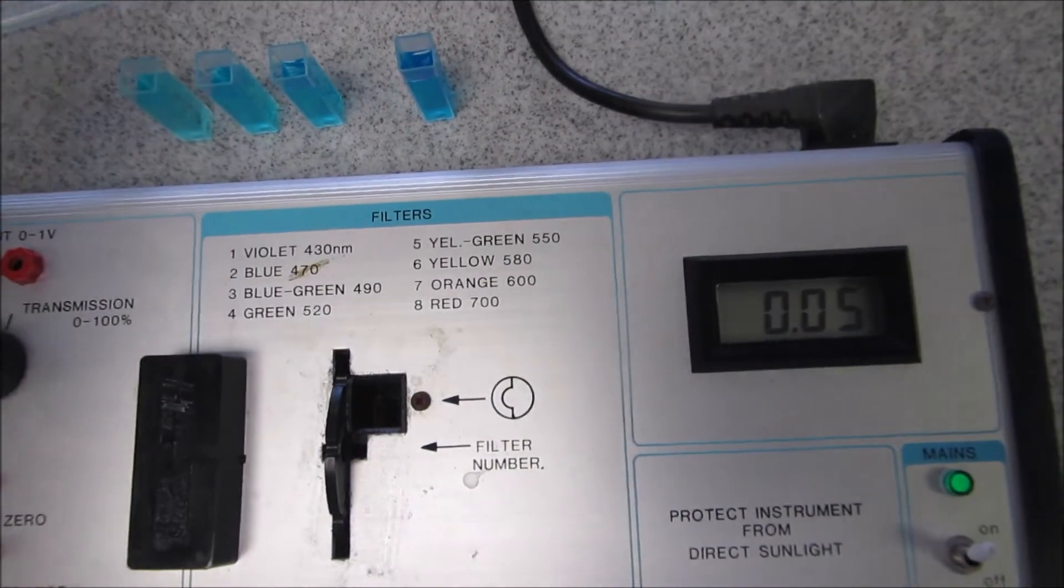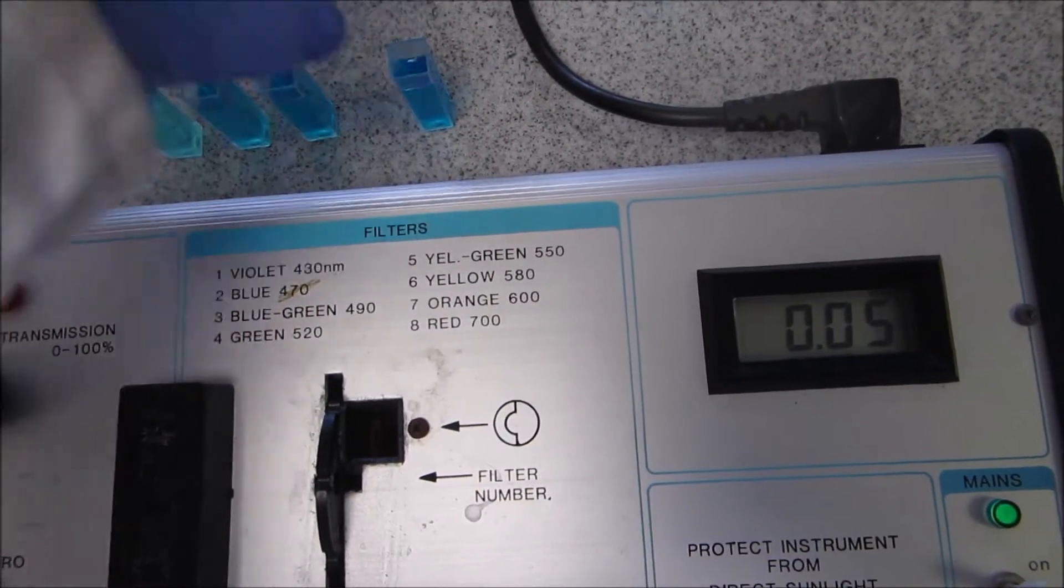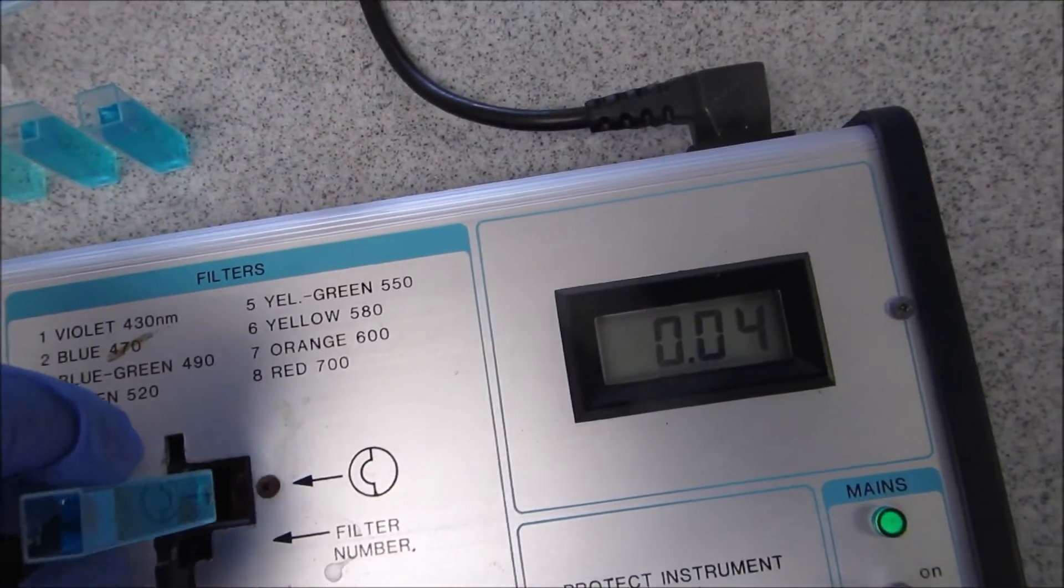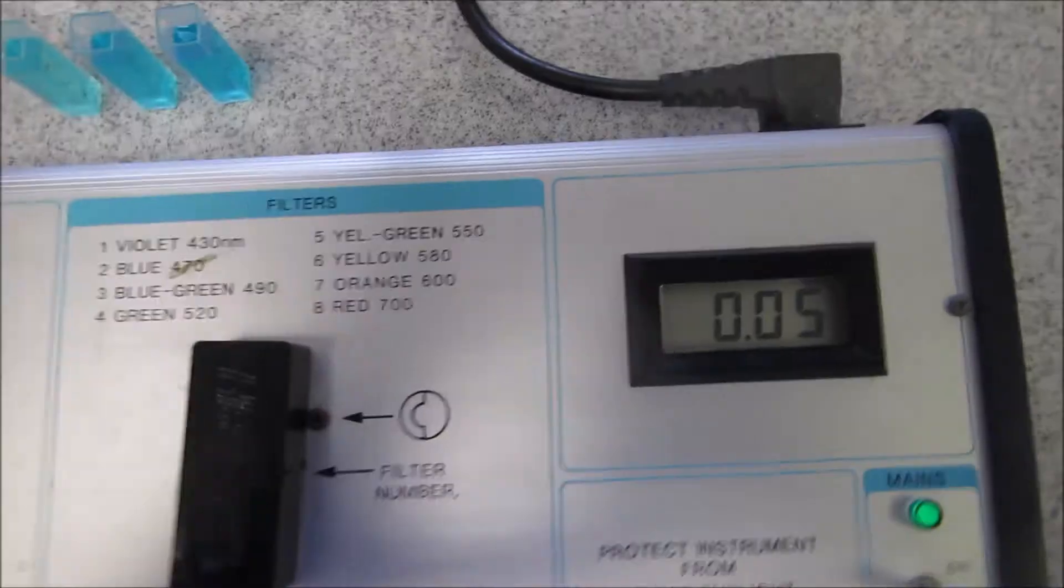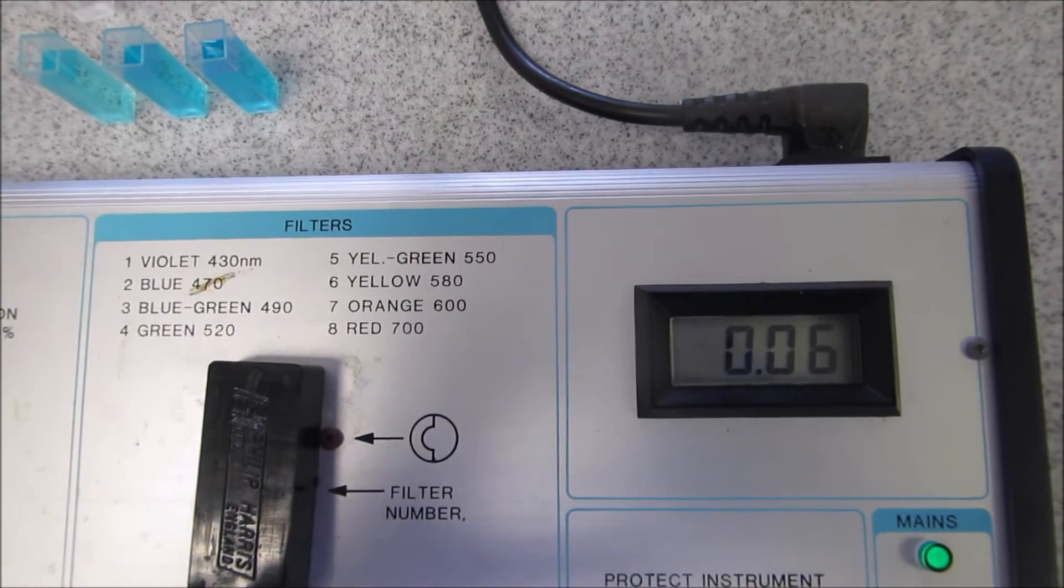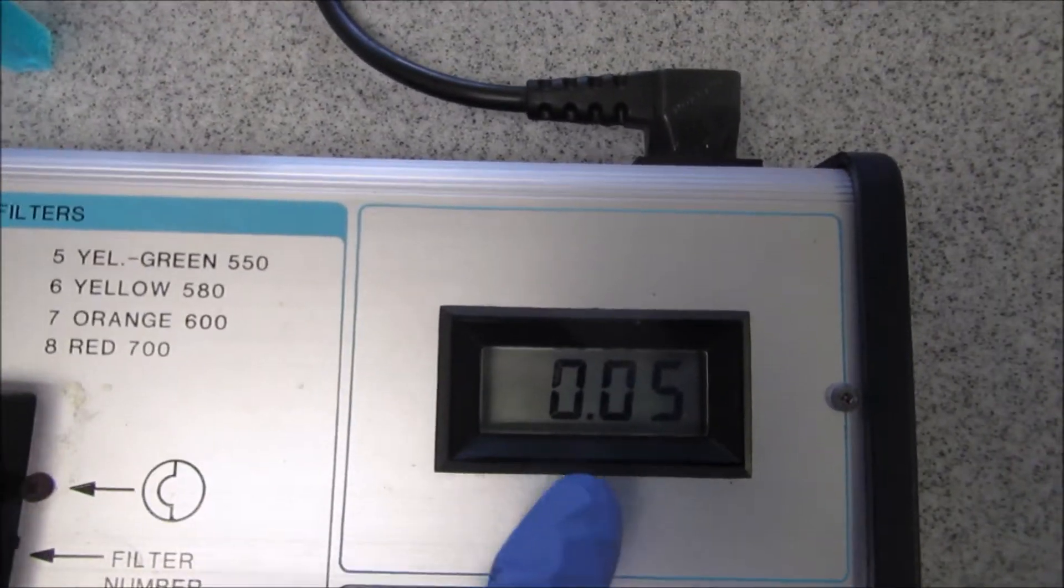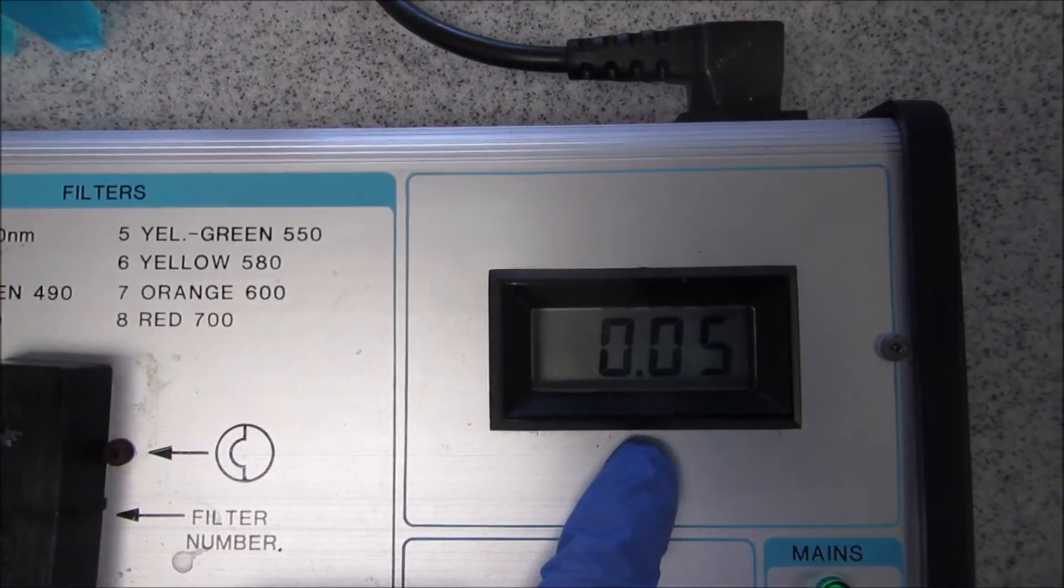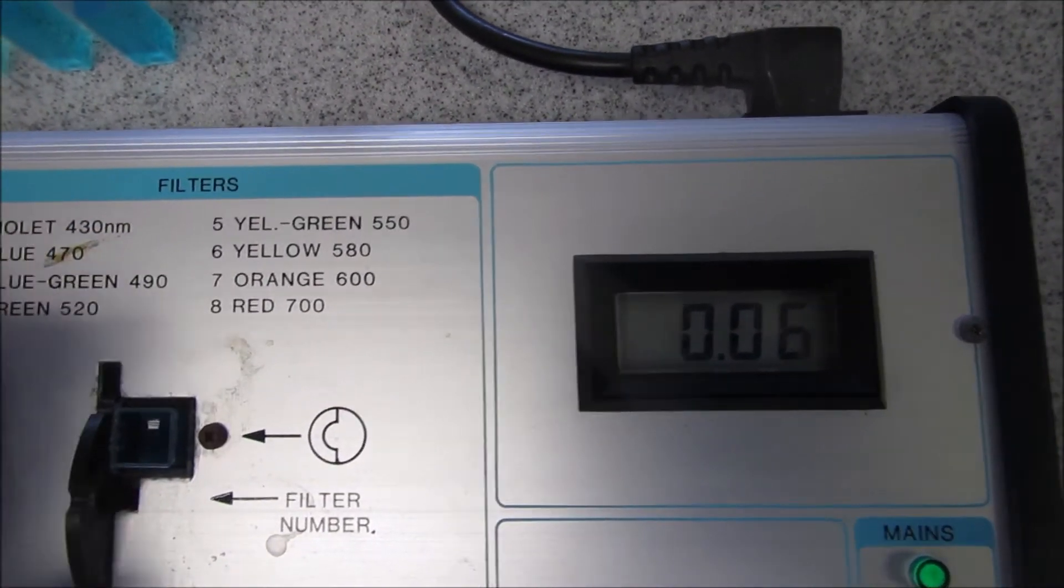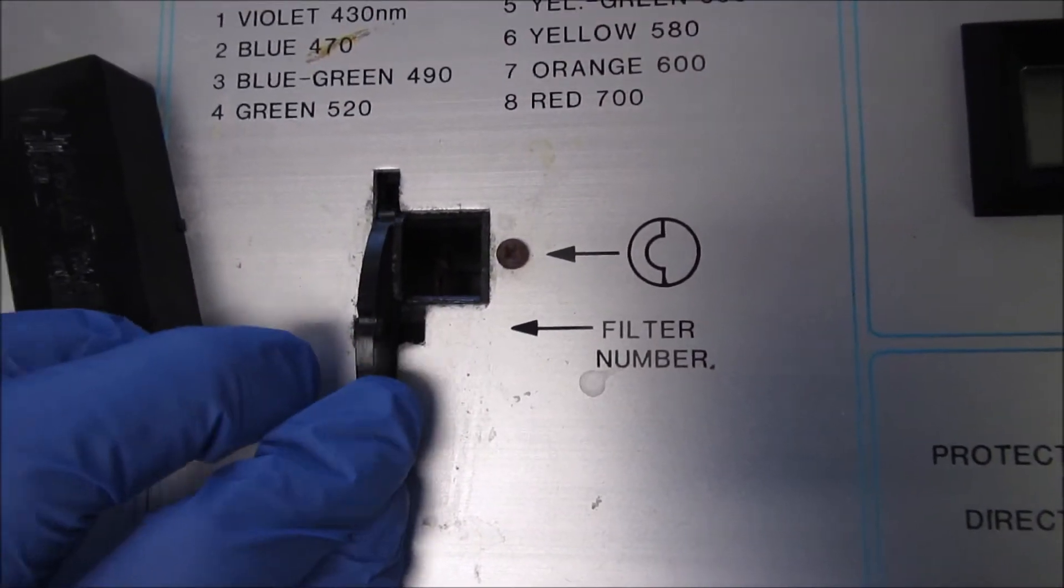This will now not detect any interference due to the water. At a wavelength of 430 nanometers, you can now see the reading for a 1 molar copper sulfate solution. I'm going to take that cuvette out and twist it to the next wavelength.